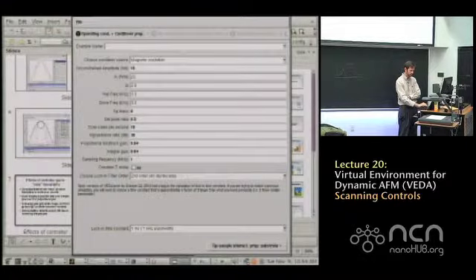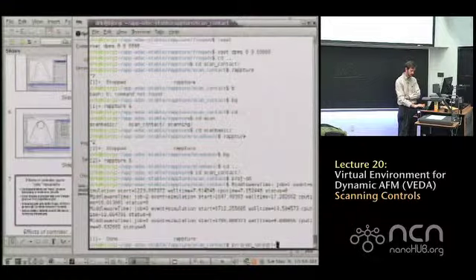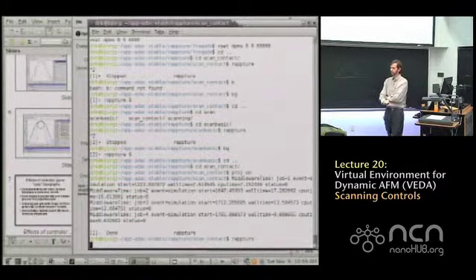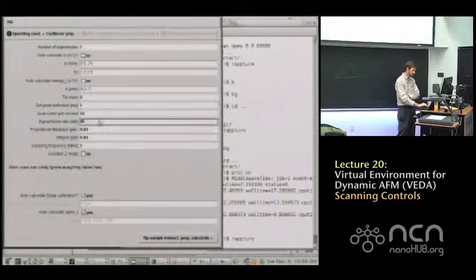Now what I'm going to do, I'm actually going to close this out and on my computer just start it again. If you wanted to do this on the website, you would just close the window, open it up again, and you'd be back to the defaults.